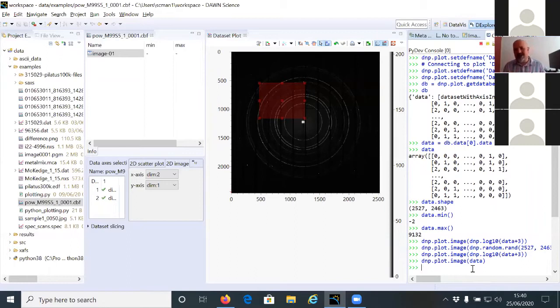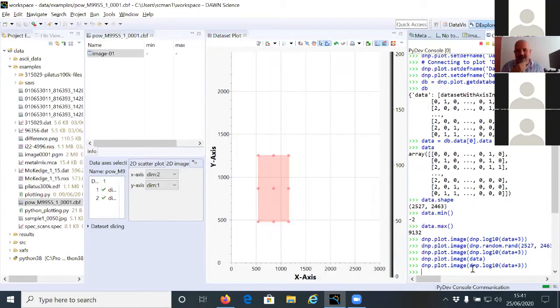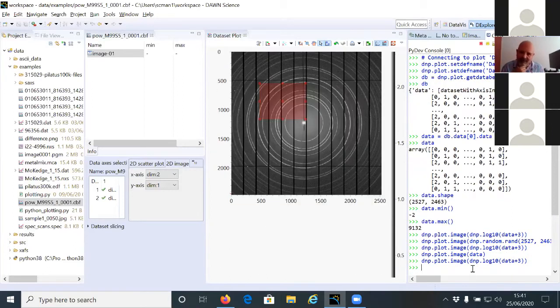But what is the use of deleting the complete data? I thought you were introducing the noise. Oh yeah, no. If you want to introduce noise, for instance, you could add random noise here. So, for instance, if I added a random number instead of 3, that would give me random noise instead of having these 3. That could be something.